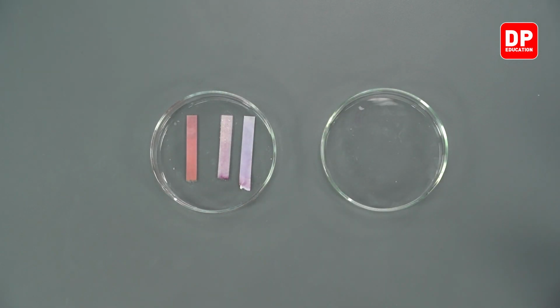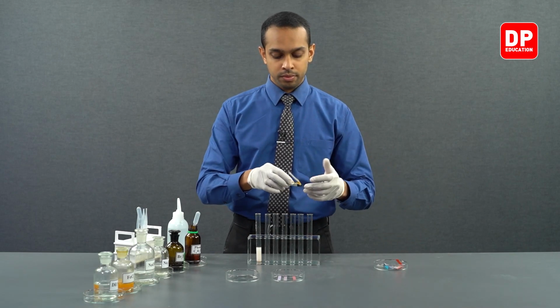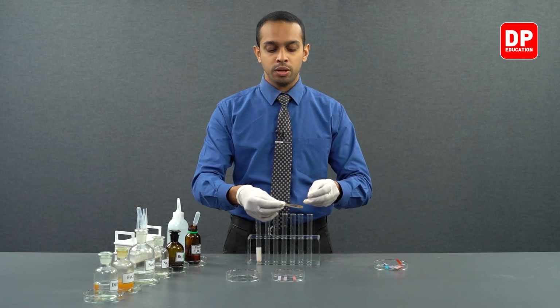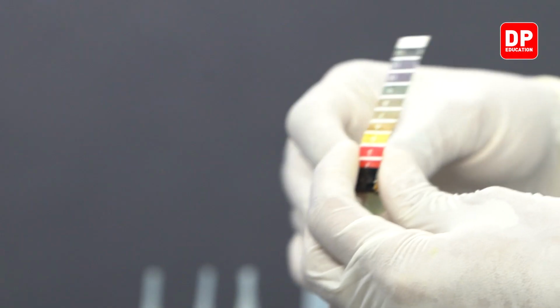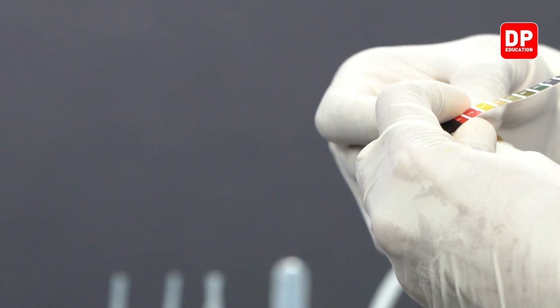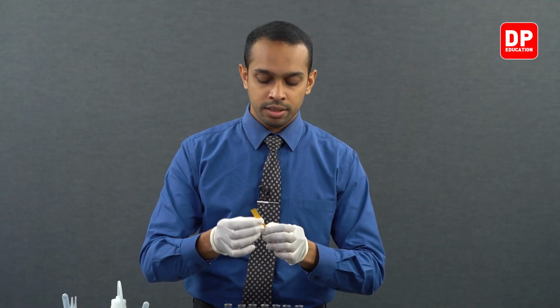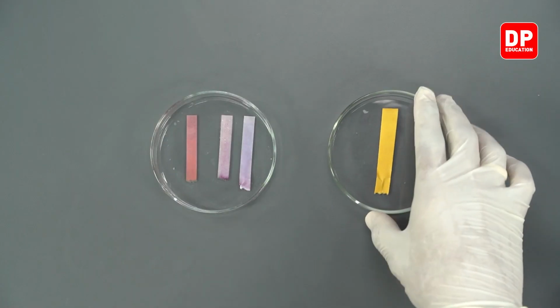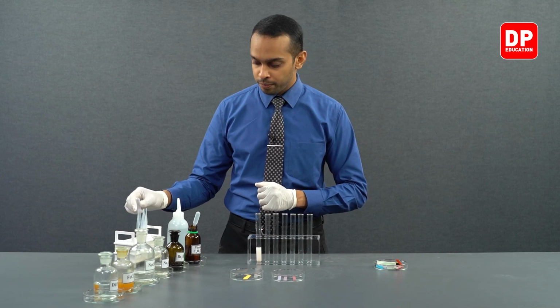Now, let's move on to our pH paper. We have our pH paper book here, and we will take a pH paper out of that book, and let's add a small amount of phenol solution into our pH paper.